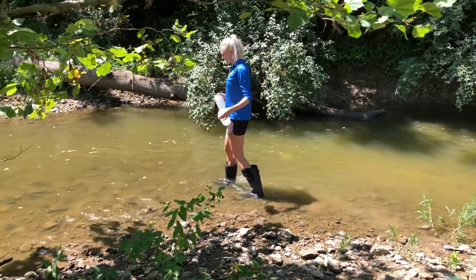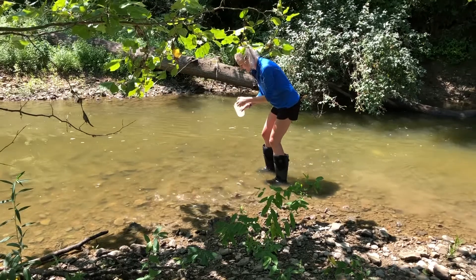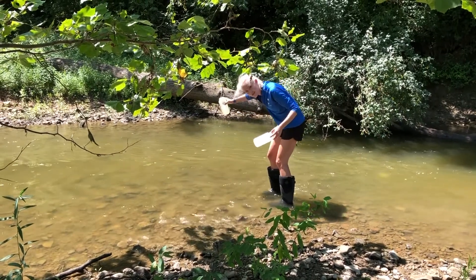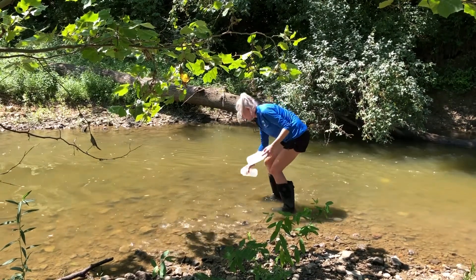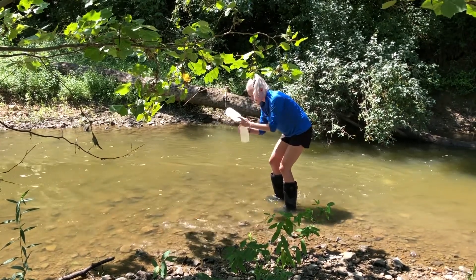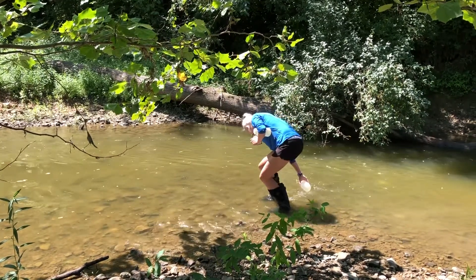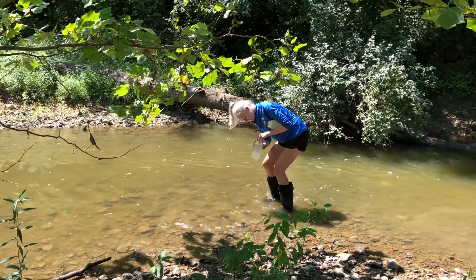I'm just going to gently wade up the stream a little bit. I'm going to take my first bottle and do a rinse of the bottle. I'll fill it up once — this is just my rinse. When dumping, we don't want to dump up high because that'll stir up the sediment, so I'm going to dump this low right behind me so it all flows that way. Our second fill-up is going to be for actual sampling, so I'll put my lid on that. Now I have my second bottle — same thing: fill it up once, dump it behind me, fill it up a second time, and put my lid on.